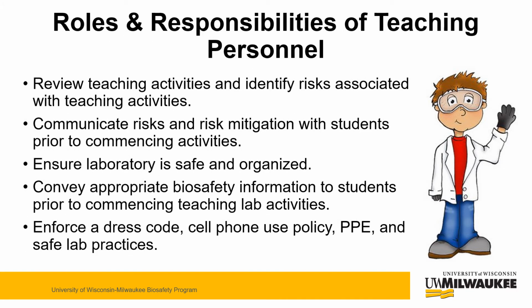Teaching personnel have unique roles and responsibilities when working with biohazardous materials with their students. They need to be responsible for reviewing all teaching activities and identifying the risks associated with the teaching activities beforehand so they can use this to effectively communicate those risks and find ways to mitigate risk with their students prior to commencing any activities. They need to ensure that the laboratory is safe and organized.